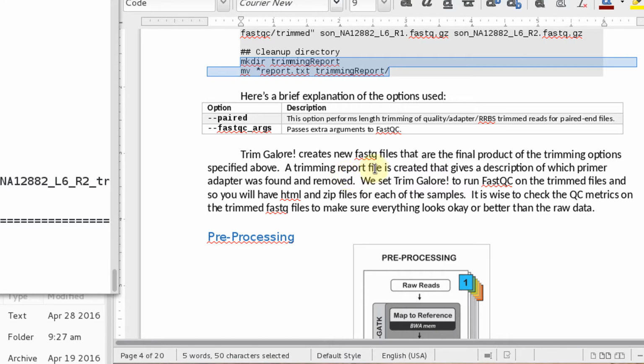So we've now completed the very beginnings of the analysis, before we even started the GATK pipeline. You need to do this for every single sample to make sure that there's nothing wrong with them from the sequencing facility that sequenced your samples. So FastQC finds the quality control metrics, and if there needs to be any modifications done, then you use some sort of trimming tool. And after trimming is done, you want to rerun FastQC to make sure things look good. And if things look great, then you're ready to start your downstream analysis.